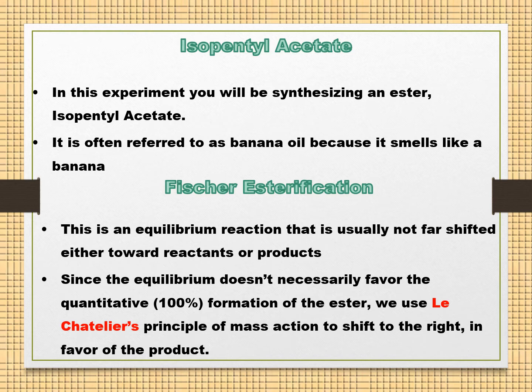However, the problem in esterification is that all reactions in the esterification process are in equilibrium, and equilibrium reactions usually don't go to completion. Because of that, we'll be using the concept of Le Chatelier's principle of mass action to get our ester in the process.